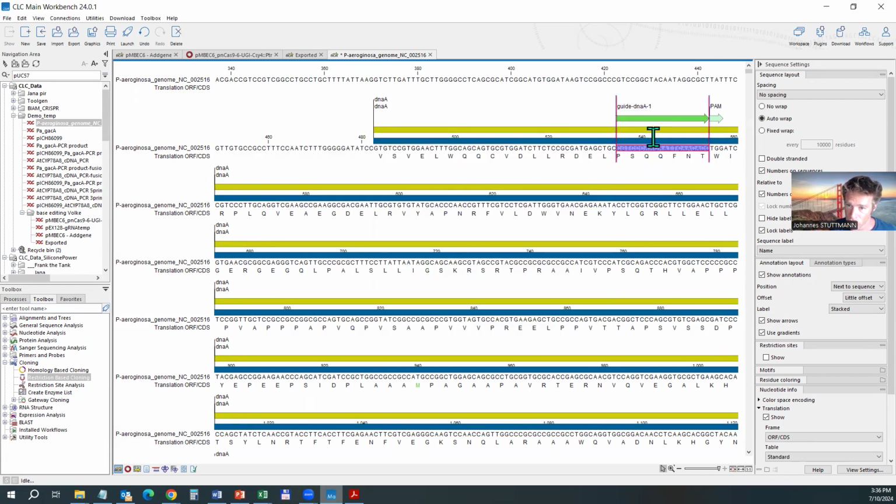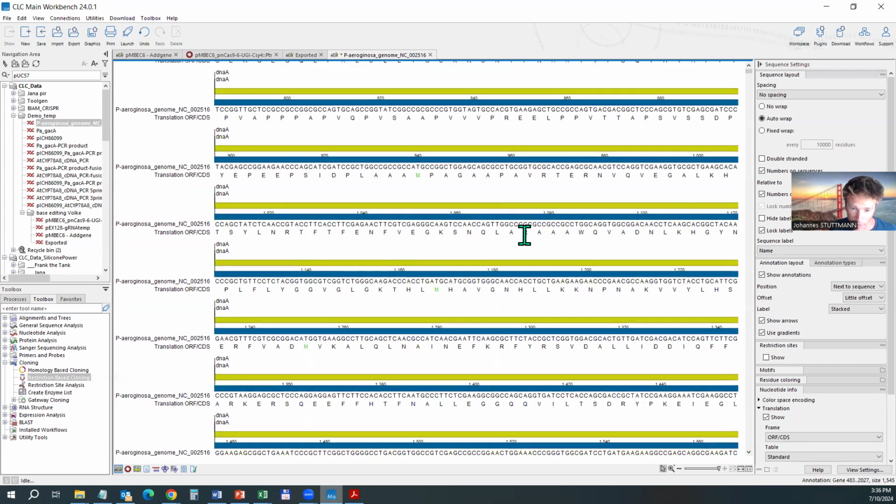So this would introduce a C to T exchange here. We get a TAA. This is a stop codon. The gene is normally dead, should not be working anymore. If we do this, we maybe should look that we don't have an additional initiation codon just downstream, because now I'm just severing the first maybe 20 amino acids. But normally it should be fine.